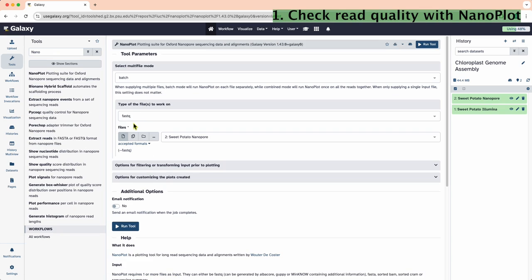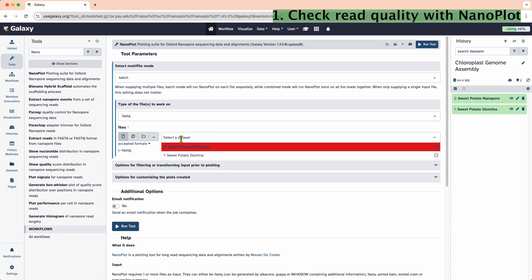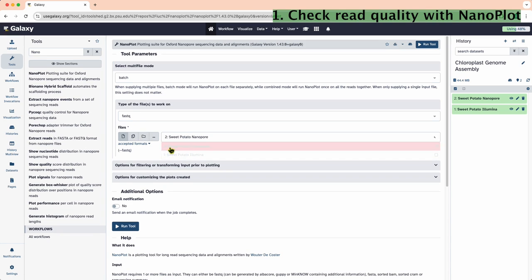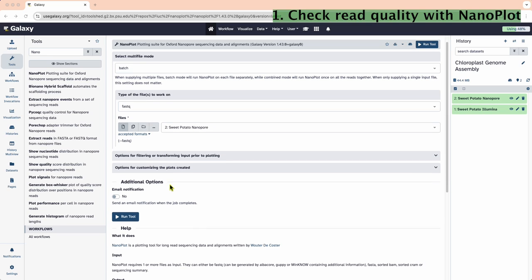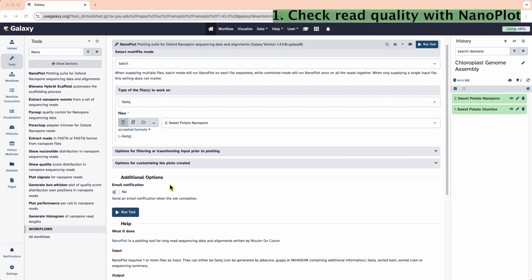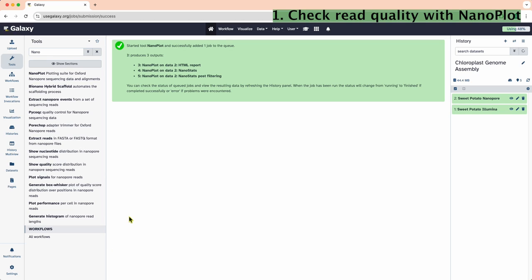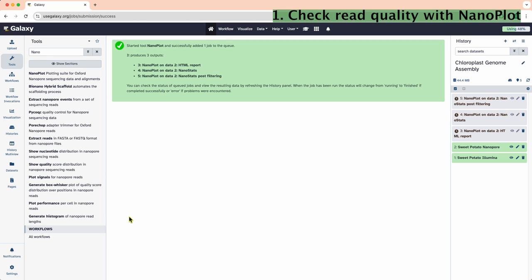We can tweak the parameters in the NanoPlot page. Batch fastq, and our nanopore fastq file. All settings seem correct. Now let's hit Run. The process is running if the color has turned orange.